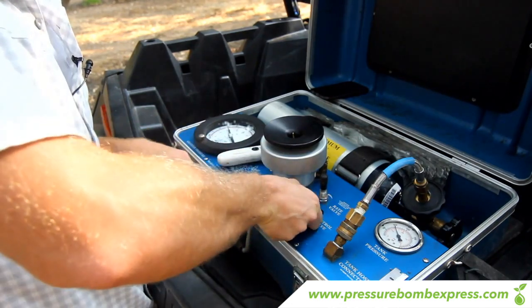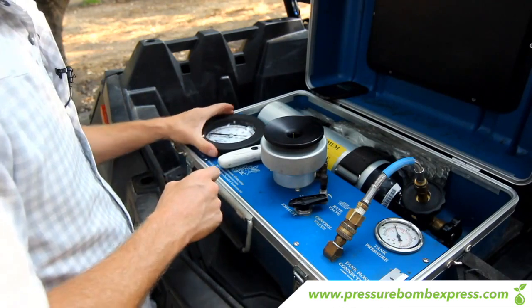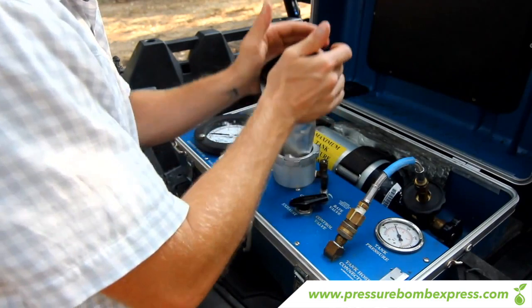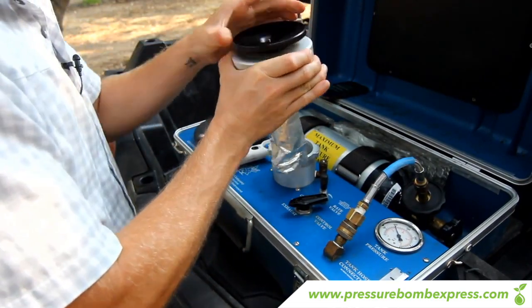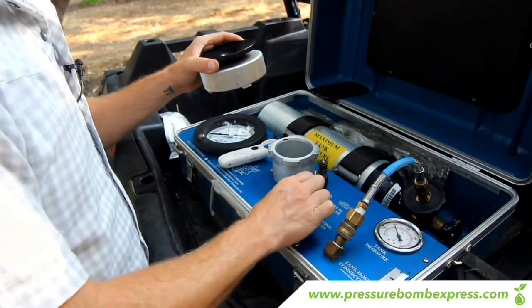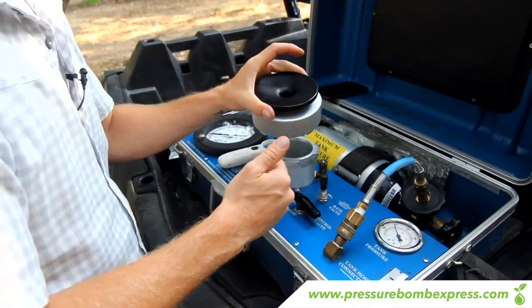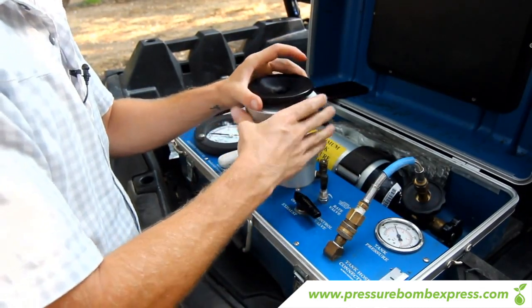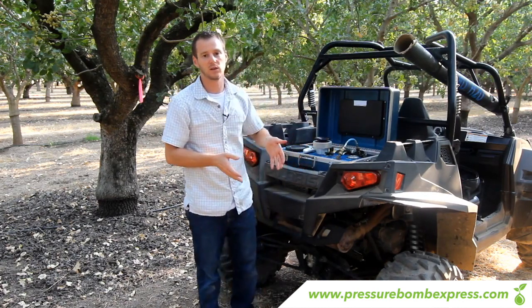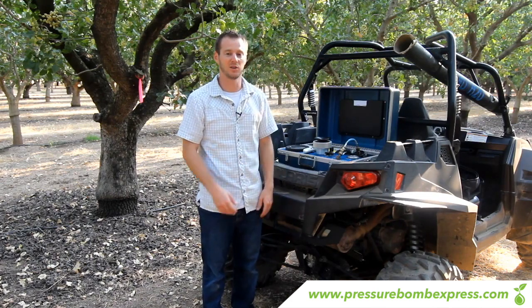After you've done that, exhaust off the pressure in the chamber. Once the gauge goes down to zero you're ready to release the cap, loosen up the top, take out your leaf, and move on to the next one. If you release the cap before the pressure is removed it will blow the top off, so make sure you exhaust off the pressure before you remove the cap. That's basically how you pressure bomb the pistachio — make sure you don't take your reading when the milky white substance is coming out; that's phloem. Wait until it's clear and then you'll get an accurate reading.